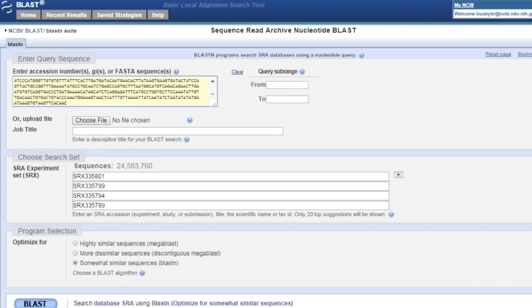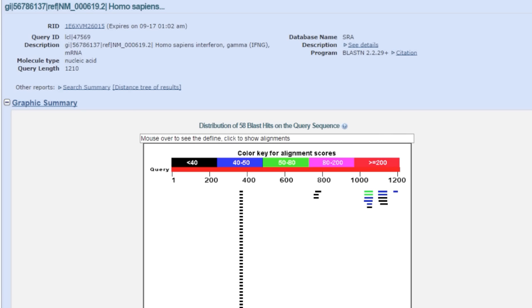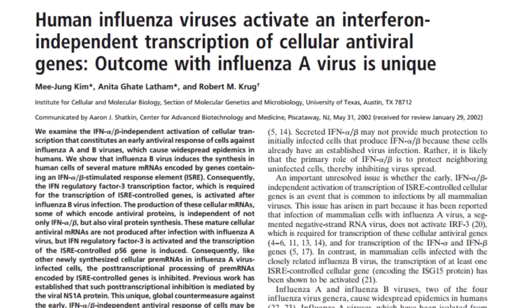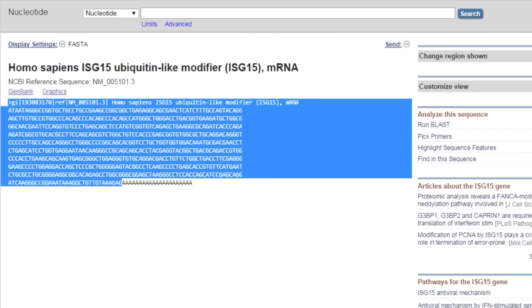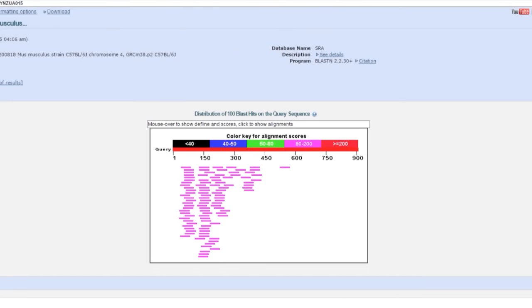So I can paste my sequence into the normal BLAST webpage and run BLAST. Unfortunately, in this example I get not very many significant hits. At first this was disheartening to me. However, with a quick look at the literature, we can see that influenza A does not stimulate the production of interferon gamma. If we find an mRNA that interferon gamma does stimulate the production of, we can BLAST it into the same sets and come up with a lot of hits.